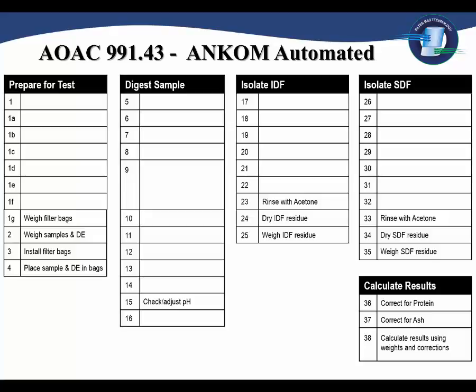I should emphasize when we're talking about this automation that it eliminates all those elements of conventional variables that can impact precision. People will say to us, well, how long does it take to do your method? And I always want to emphasize, remember, we are running the method. So we are running AOAC 991.43 or 985.29 or the Codex methods. And so we can't change the times. We have to do everything in accordance with the method.